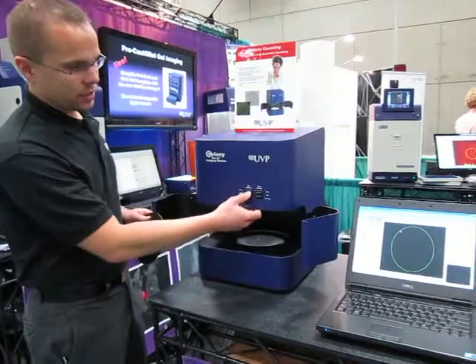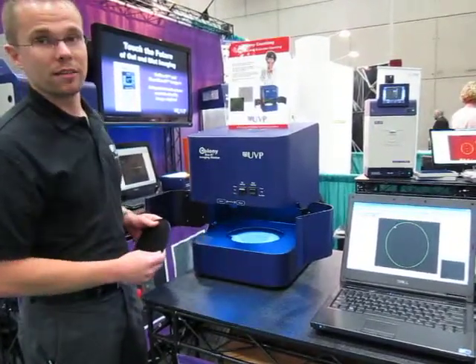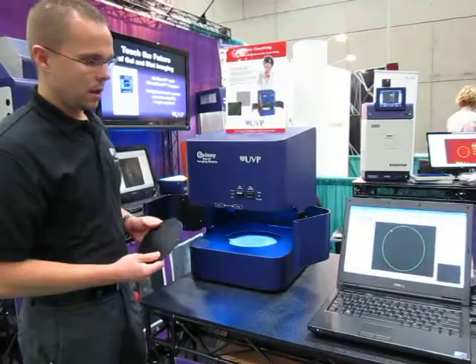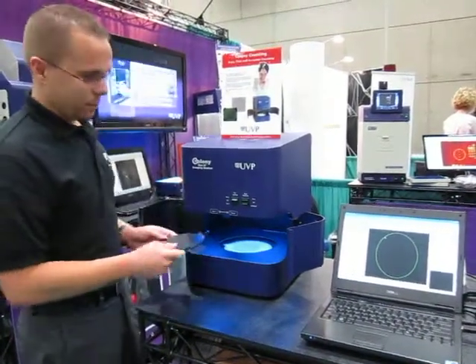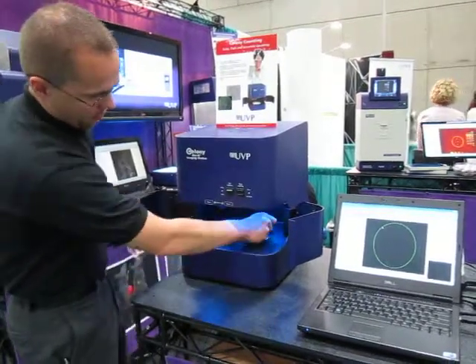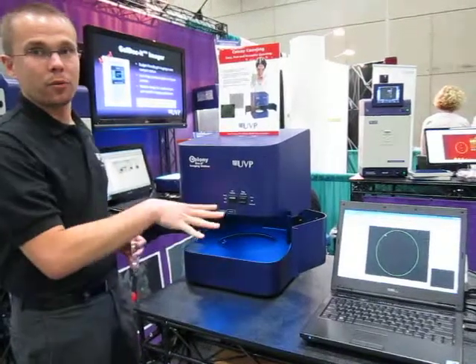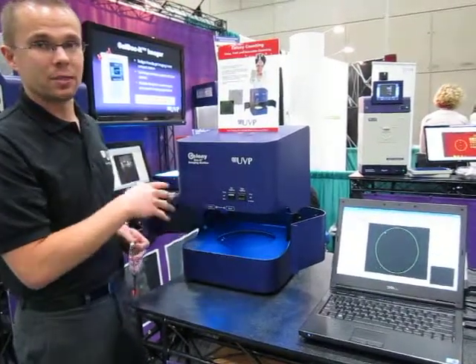The system also integrates epi-white overhead light as well as blue overhead light for GFP samples. A standard plate can be placed on the base so that there's no light coming from the bottom for samples that you need to illuminate simply overhead.